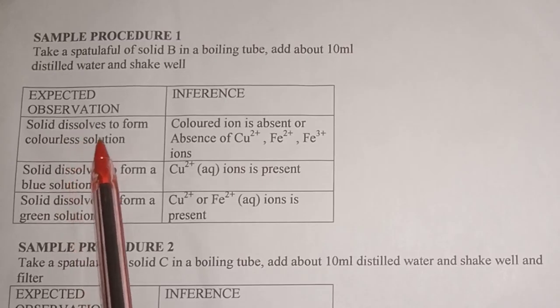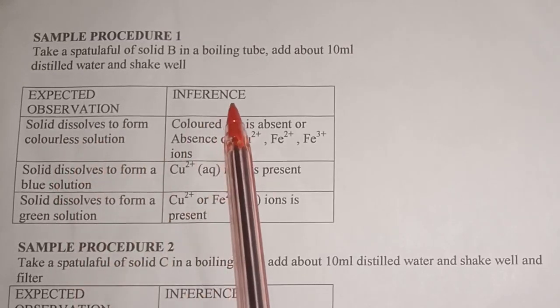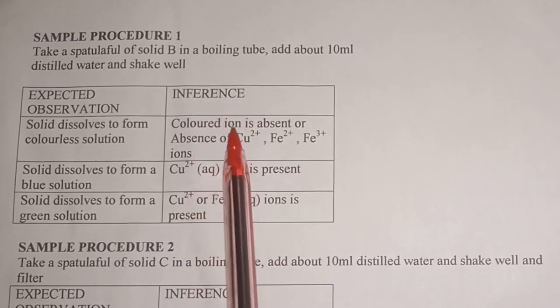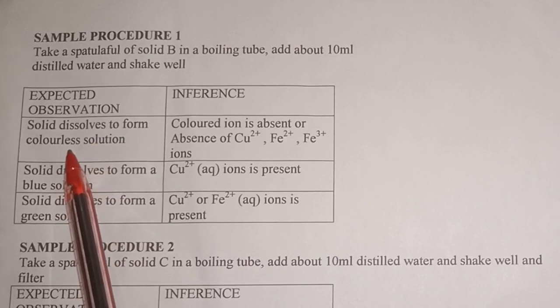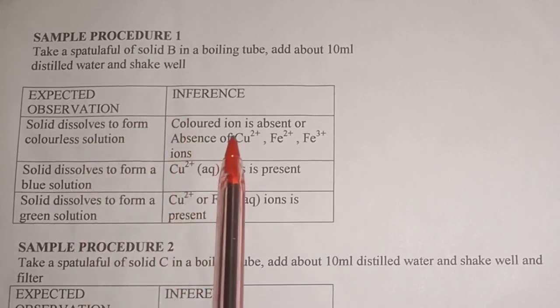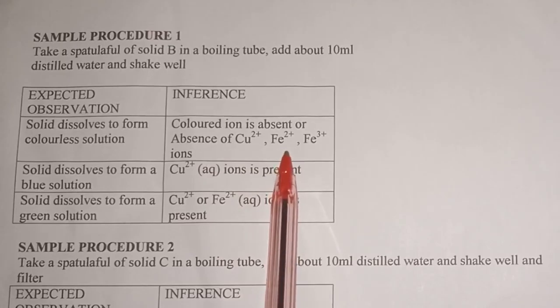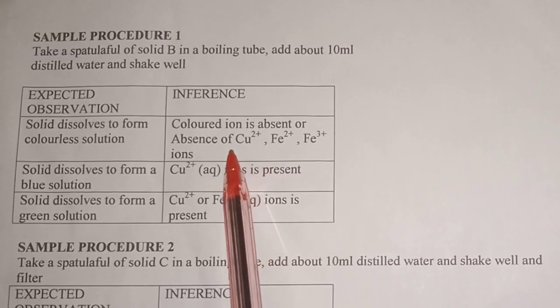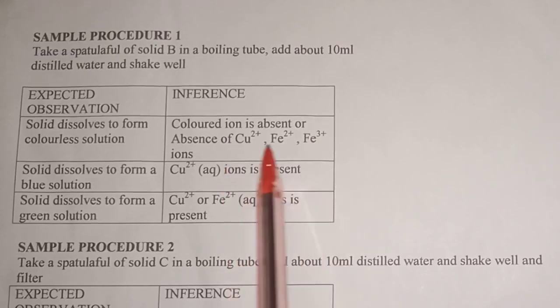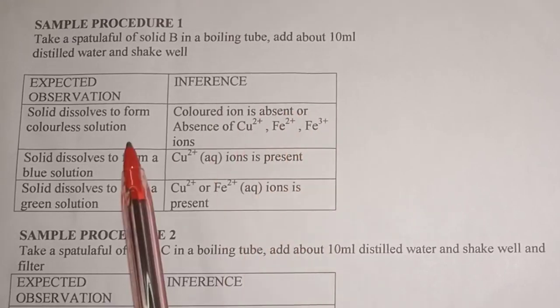So what is the expected observation here? If you get solid dissolves to form a colorless solution, then the inference that you are supposed to write here is colored ions absent. Why do you say absent? Because here we get a colorless solution. And the colored ions which are absent here usually are copper 2 ions, iron 2 ions, iron 3 ions. But if you are unable to write this formula, don't commit yourself. Just write colored ions absent, full stop.